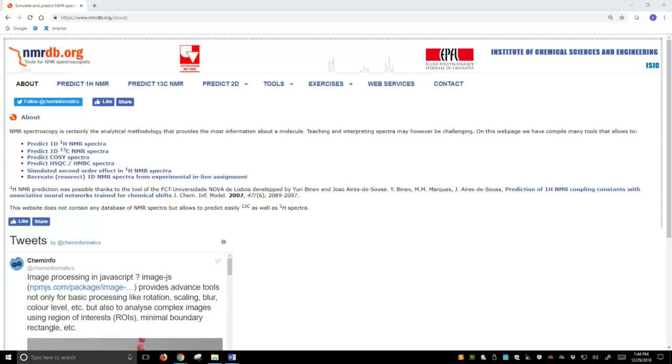It's an online tool that allows you to input a chemical structure, and the tool will predict NMR spectroscopic information. For us, that means Proton NMR because we're focused on Proton NMR, but it also does C13 NMR and has some other tools as well. It's a really slick website.